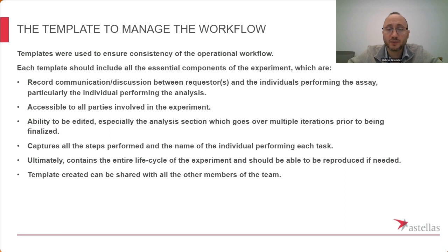Okay, but in the experiment we'll also capture all the steps that are performed and name the individuals that are performing each task. And again, this is very important because we wanted to know that all tasks were completed. Prior to us using the ELN, there were instances where the requester would send us an email asking, where are my samples? And then we would have to try to find out, through the paperwork that we used before, what step of the life cycle of the experiment we were in.